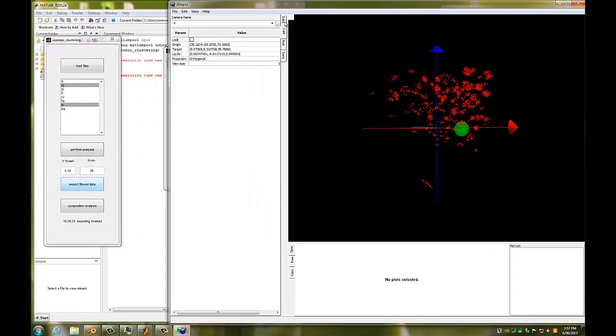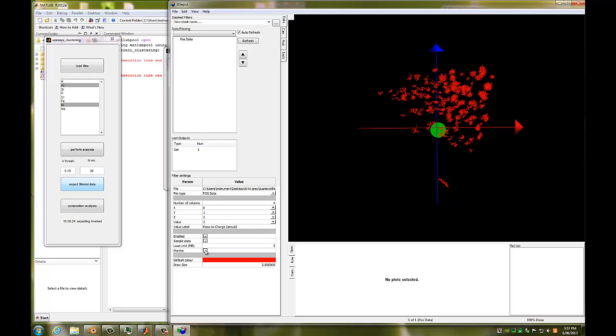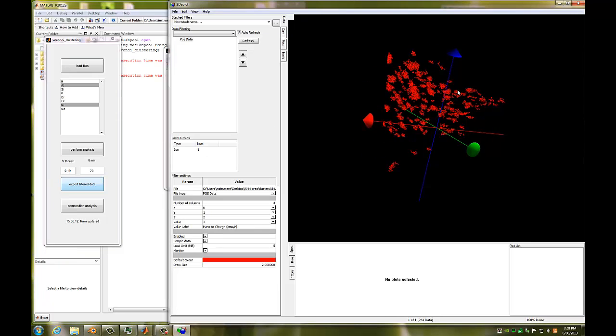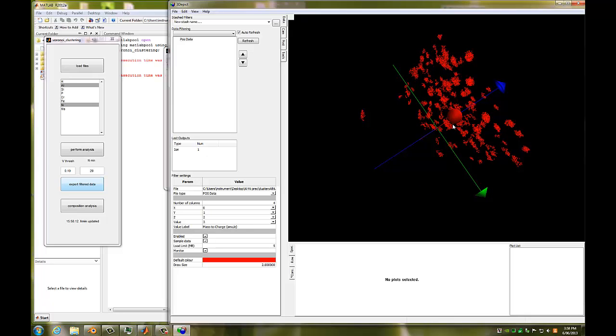But 3Depict actually has a very handy option, which is the monitor file option. So whenever we change a file, it will update the POS file. And my program knows that as well. So if you change nmin, it will actually redo the nmin cluster definition and overwrite the file. So if I type in 50, it updates that. 20 is what we had originally, and that's our cluster nmin that we're using in this case, because that was where the linear tail of the distribution was.